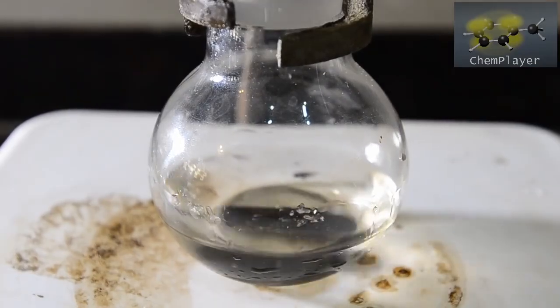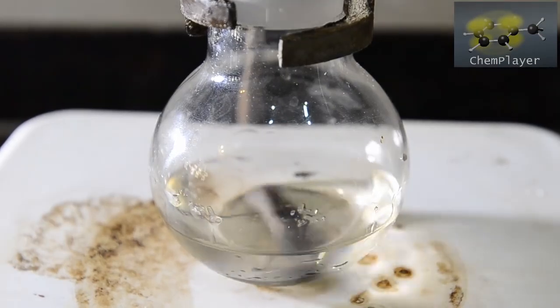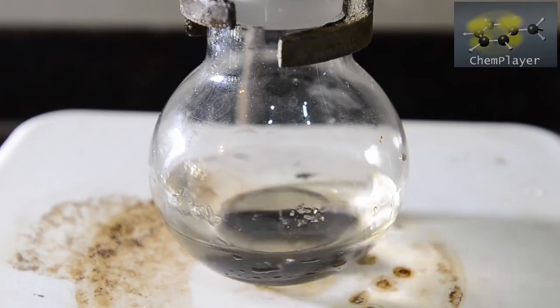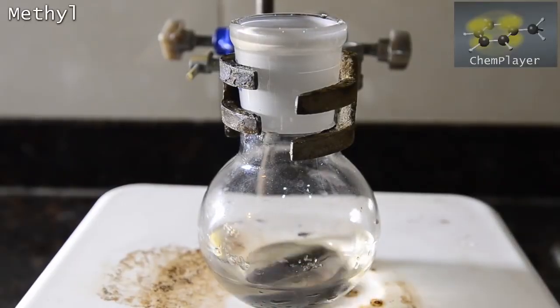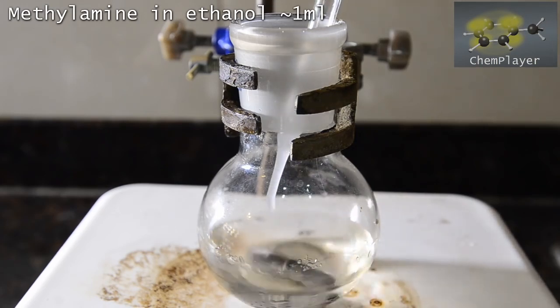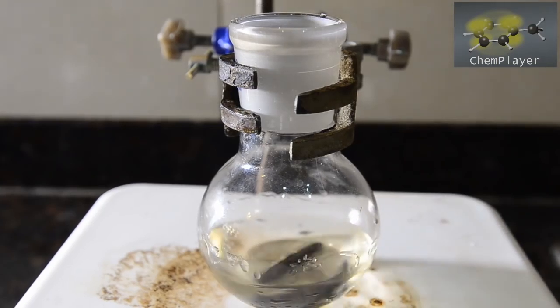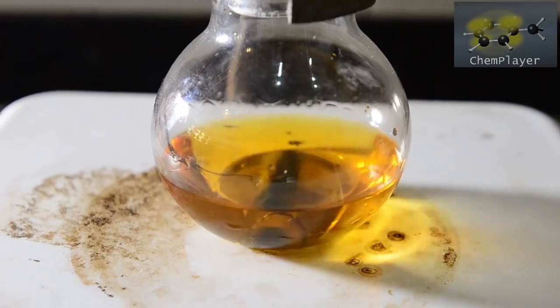All the vanillin has dissolved in the ethanol and nitromethane now, but there's still no sign of a color change, as you can see. Let's add about 1 ml of our catalyst to the mixture. The mixture quickly starts to turn yellow, and in about 2 minutes looks like this.